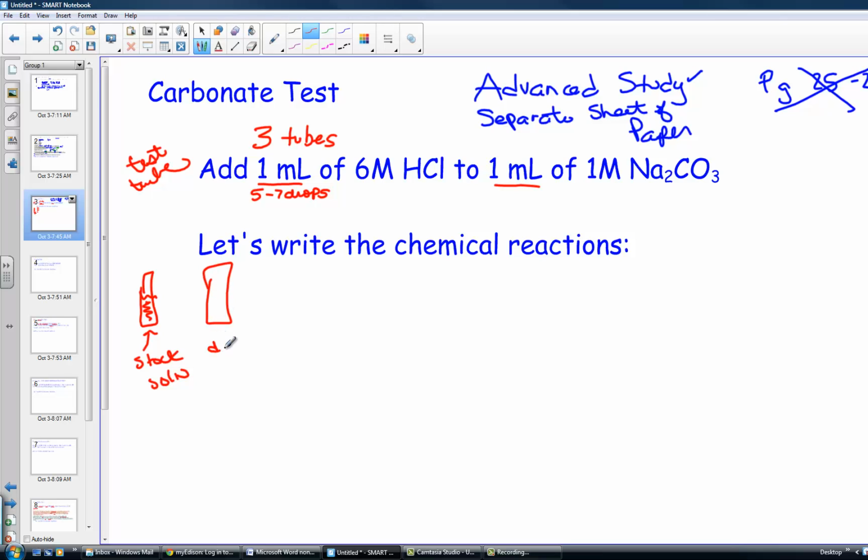This is my diluted stock solution. We're testing for the carbonate. So before I can even begin this, I've got to dilute down with that 1:9 ratio. I place in 1 ml of the sodium carbonate, and into the grad cylinder, I'm adding 9 more mils of water. And please stir so that your sample isn't down here. Because if I take my pipette and just draw off a mil or so, I'm only going to get water. We want a uniform solution, so stir it. Take a stirring rod and make sure that you're agitating that for a complete homogeneous mixture.